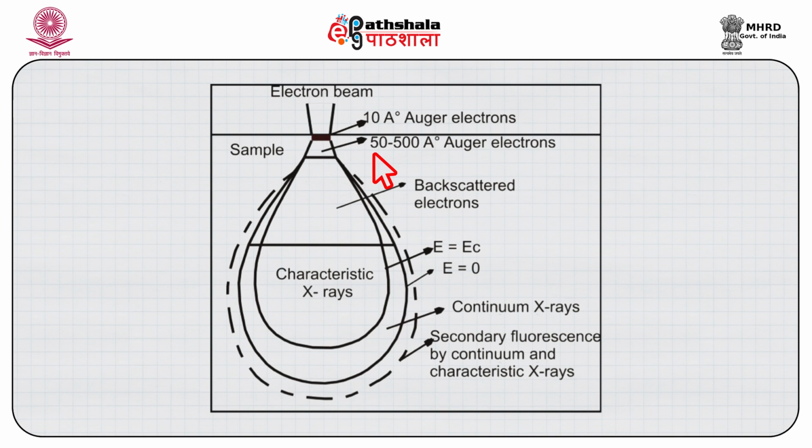So, several of these effects ultimately contribute to the complex result, and one can catch each of these in the form of an individual characterizing effect as a microscopy function.